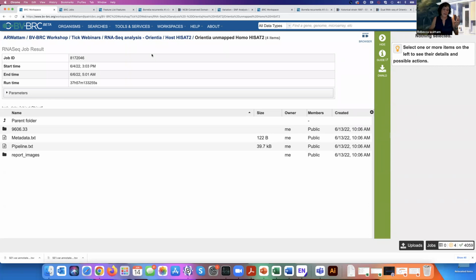Oh, in DESeq2, you need 2 replicates to run it and get differential expression. If you only have 1, it won't run it. But 3 is generally the standard. But you can do it with 2. But the recommended standard is 3. Obviously, the more replicates you have in theory, the better the statistics are. But I think you reach a point after 3, 4, or 5 that the statistics don't change that dramatically. And the chance of the job failing increases substantially. Good point. Any other questions from anyone?